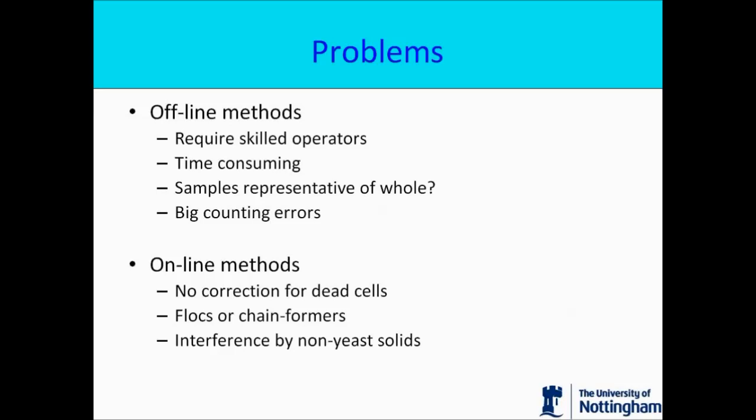On the other hand, if you look at the online methods that are used, since these are in effect just based upon light scattering, clearly they will measure the presence of any particles that are present within the operating field. So they will not correct for dead cells. They will not correct for non-yeast solids that might also be present.